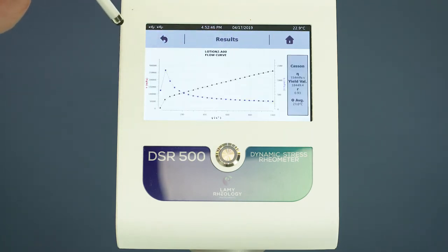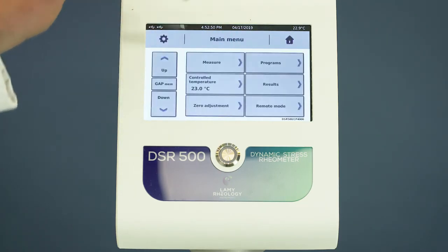As you can see, a measurement with DSR 500 CP 4000 is so easy.